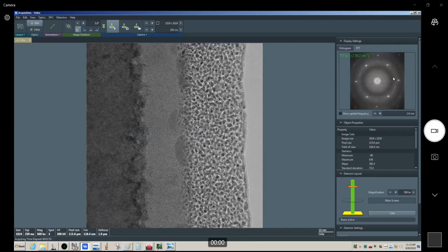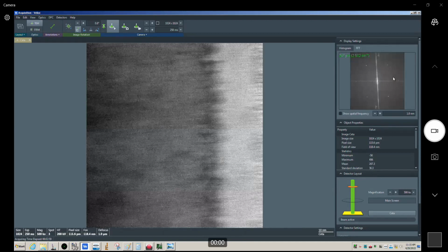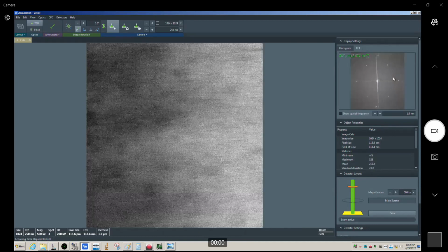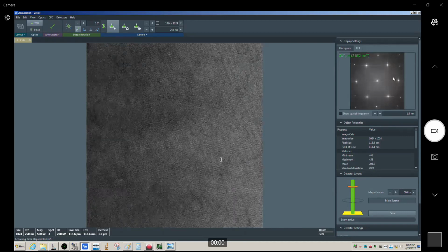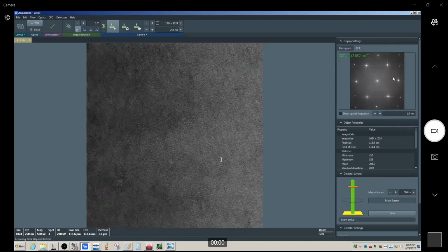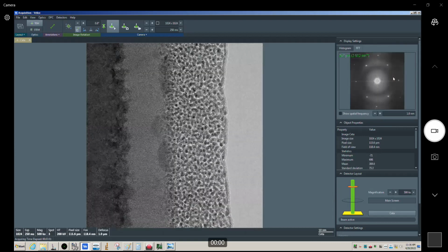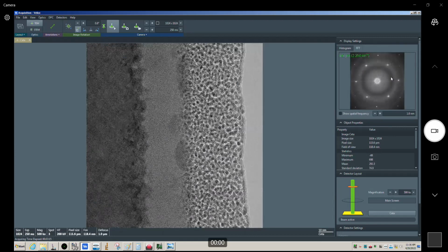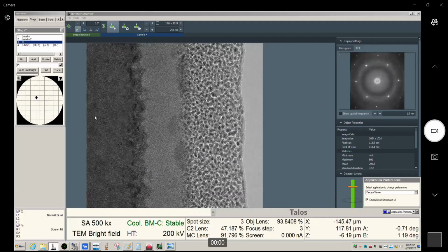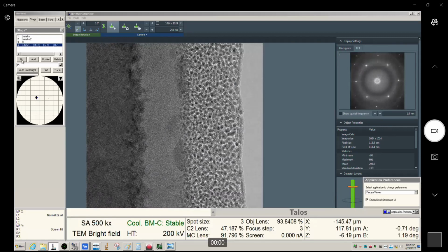But obviously you can't correct it on this one, this is all crystalline. And again, I'm getting very little distinct amorphous signal there in the FFT. But if I move over here, this works great for that. So now, once I've tweaked this, I can drive back and hopefully this works pretty good. It may not be perfect.